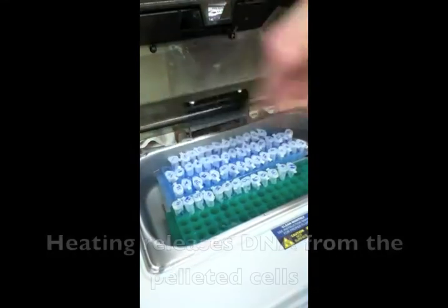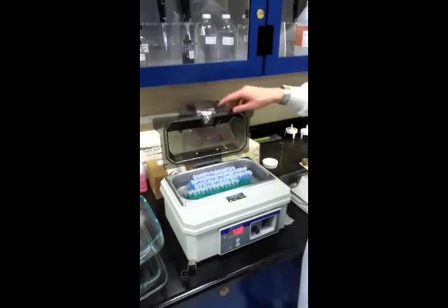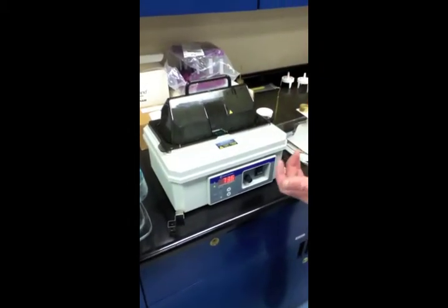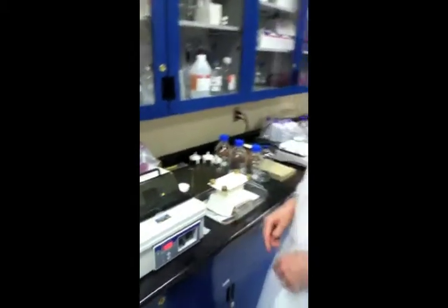They are now numbered according to a secret code that we'll share with you, so your sample will be known. And we're trying to boil them. Our water bath is at 74, but it's probably hot enough to denature the proteins and partially denature the DNA and prevent the DNA from being degraded, at least before we do the PCR.